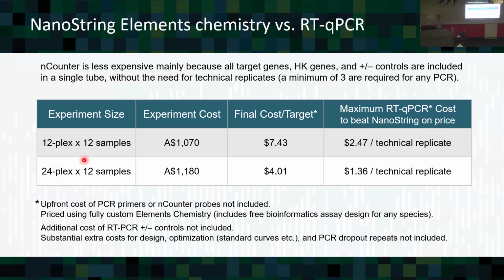So it's iterative. Yes. They have their bioinformatics pipeline, which they call the gauntlet, because you've got to run the gauntlet. There's Gauntlet 2.0 now or something. It's really sophisticated. So you get all that for free.